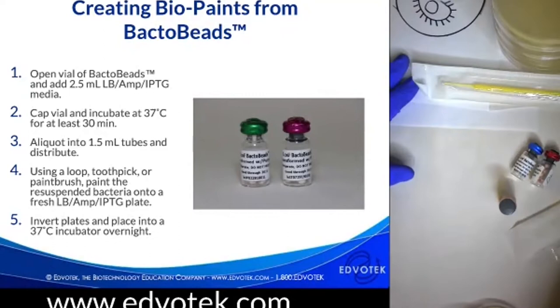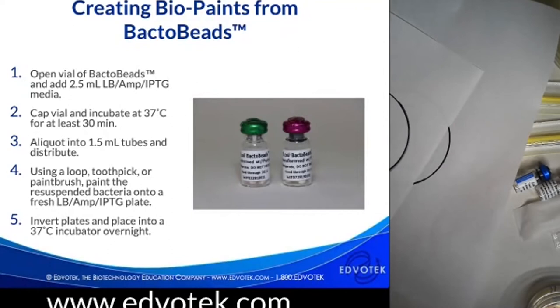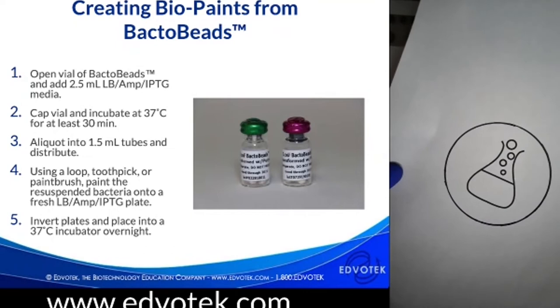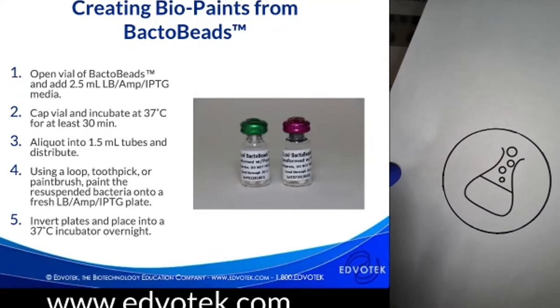One thing I like to do, especially when you're doing this with students, is remember that some of them might be a little nervous about creating work for the first time. They might not think they're artistic. They might not think they're creative. So this is actually a piece of clip art that I printed. I took a Petri plate and drew a circle around it. It's nice to give the students an opportunity to draw on paper first in case they're nervous about going right to the plate. They can plan out their artwork ahead of time and get comfortable.